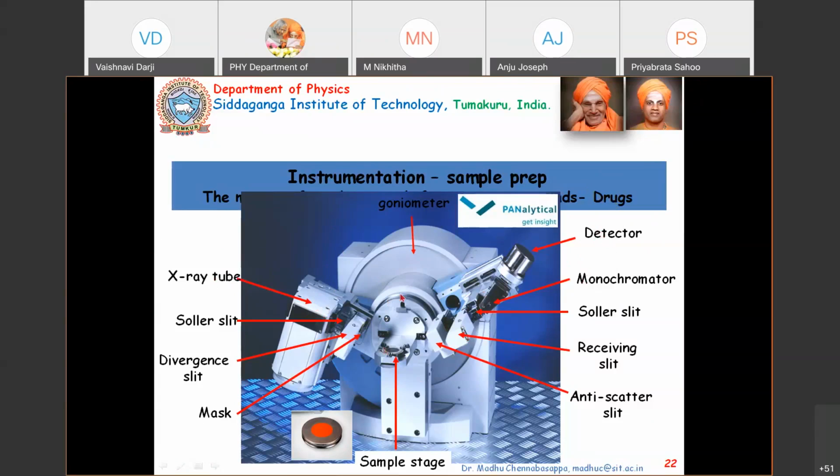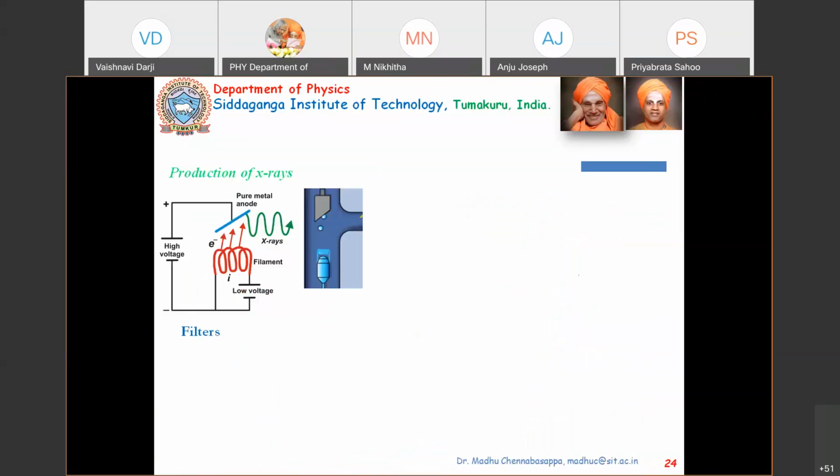There are some X-ray diffractometers, for example some old tabletop diffractometers, where the X-ray tube is fixed. So what happens is both the sample and your detector move. Still, that is your 2 theta arrangement. The sample stage and detector both move with constant speed, or constant angle.